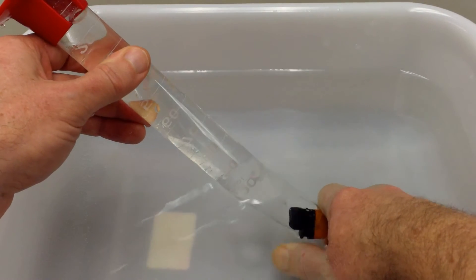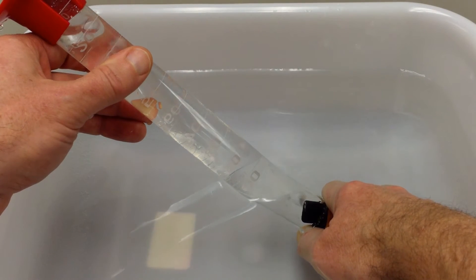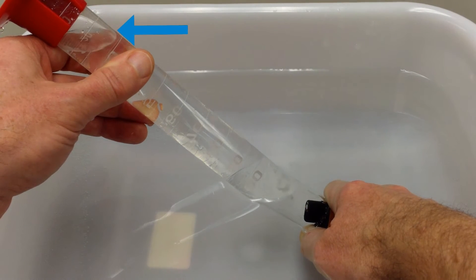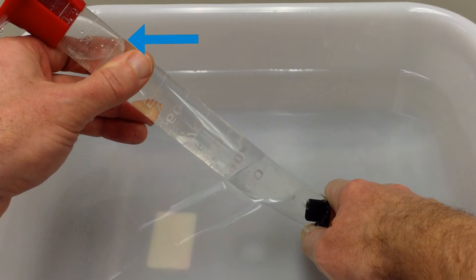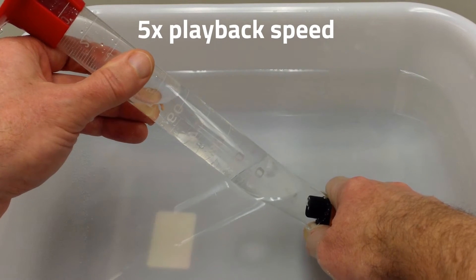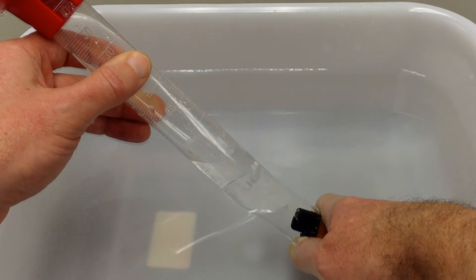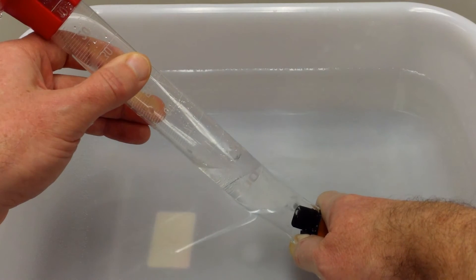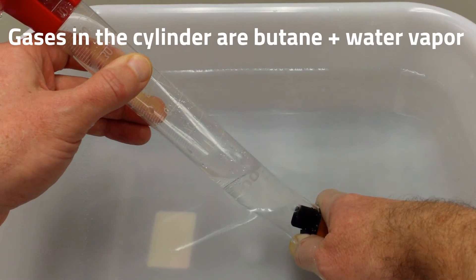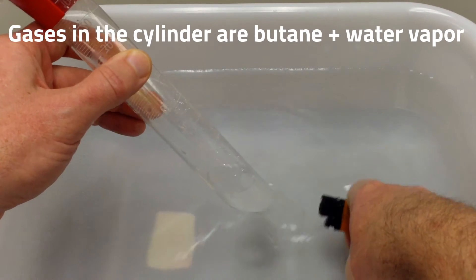We're going to see a pocket of gas forming in the graduated cylinder, and I'm going to fill this until I've dispensed between 95 and 100 milliliters of butane. Because of the angle, I'll let it go a little beyond what looks like 100, but stop just short of that.